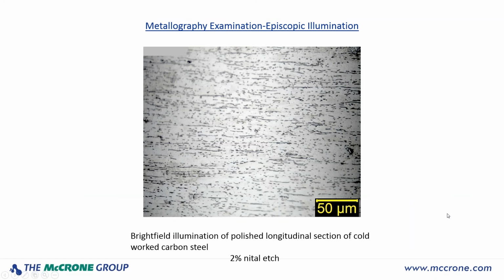Now here's an example of bright field illumination from a polished longitudinal section of a cold worked carbon steel. And this is 2% nital etch. Nital is nitric acid in methanol. And this is 2% by volume nitric acid in the methanol. That's used quite often for carbon steel to highlight the grain structure so that we can see the flow of the grains and so forth.